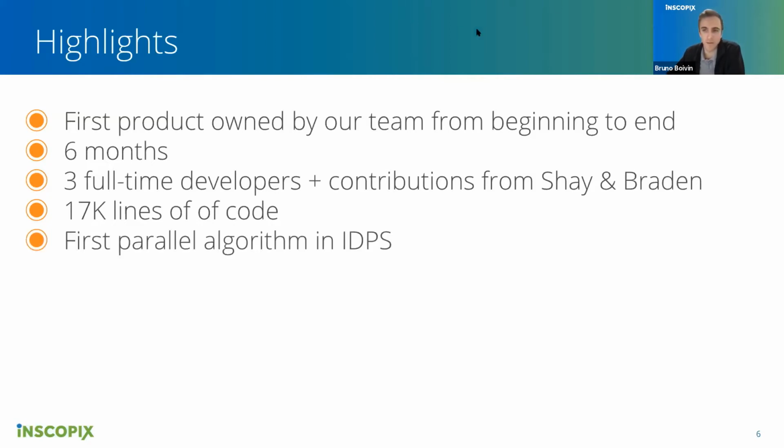It's also the first time in IDPS that we're doing things in parallel. So prior to CNMFE, everything was kind of done sequentially. So if you had a movie and you were running PCA/ICA, for example, it would take one frame, process it, take the next frame, process it. So it'll go through all the frames one at a time. But with CNMFE, that's not entirely possible because of the way the algorithm works. And also because of the fact that it's very computationally expensive. If we were not doing things in parallel, it would really take forever to run CNMFE.